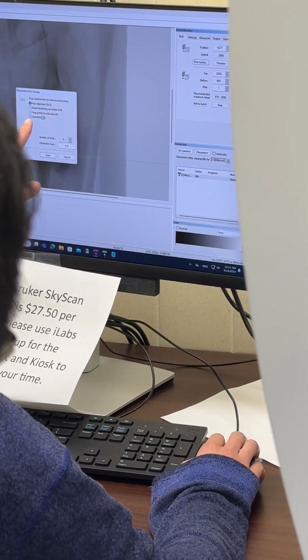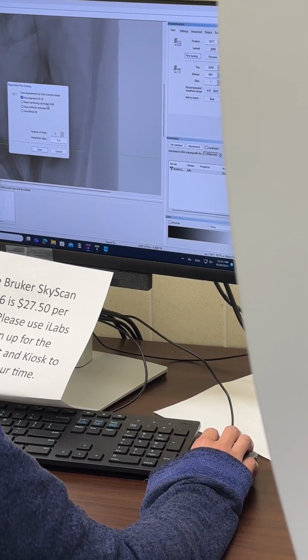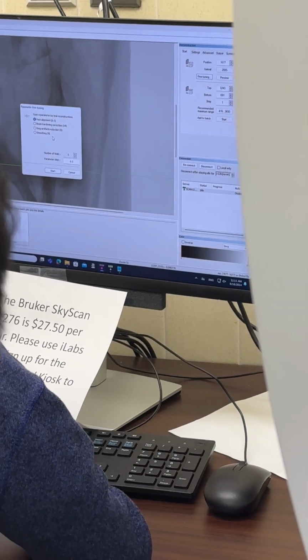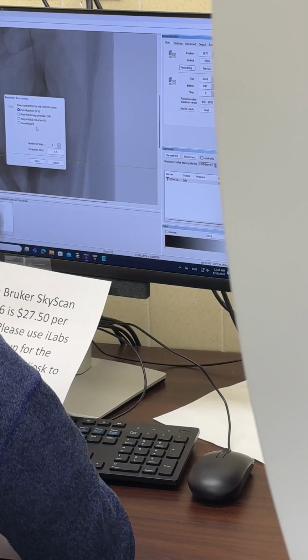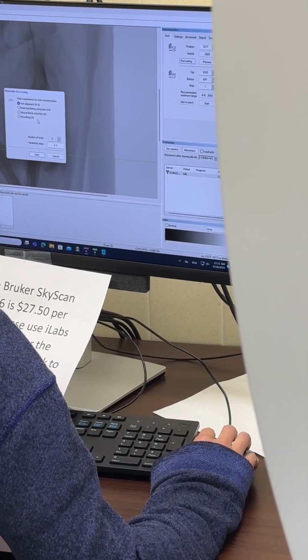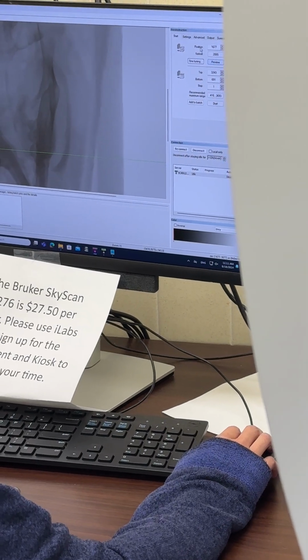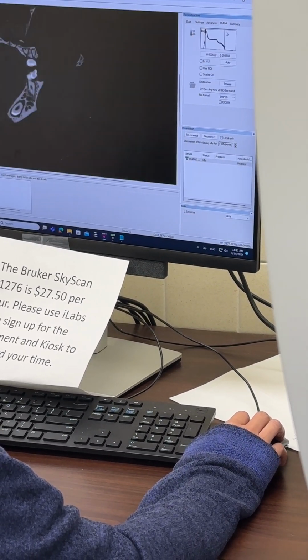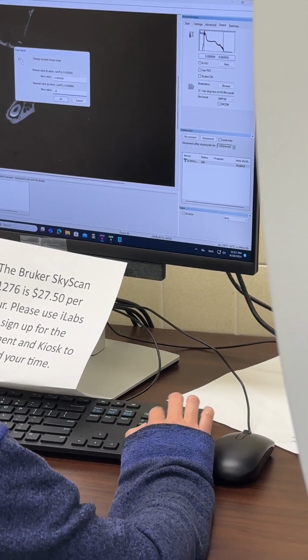I will explain a little bit more why I tried his sample. But for now, our side doesn't need to change anything. Just this one is a setting. For 950. Okay. Cancel. So this is the thing. Double check. That's the one we already done, and then we change this one to 0.09.